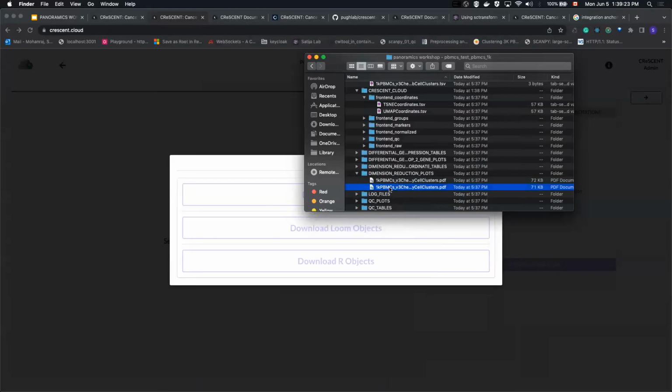Yeah. And then one very specific question: are there runs like batches, or are batches managed in a different way? You mentioned that you can control for batches for the... what do you mean by batches? Like between different technical variants?